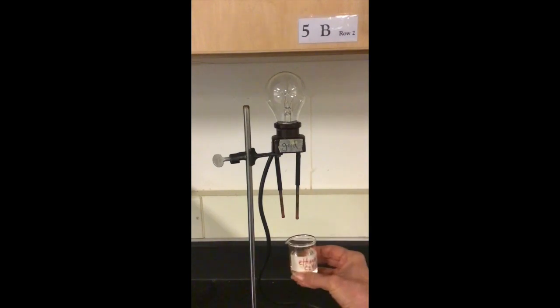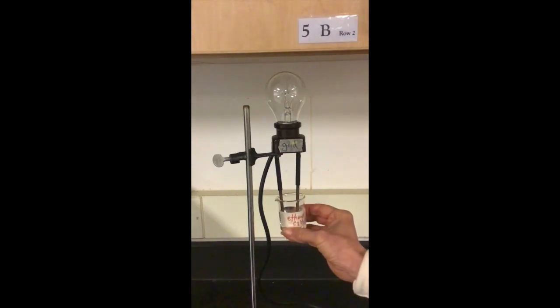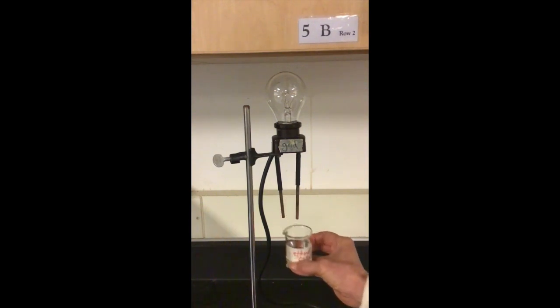The last solution is ethanol, which is drinking alcohol. You're recording in your notebook with these solutions whether they conduct electricity or not, based on how much the light bulb lights up, and whether they are non-electrolytes, weak or strong electrolytes.